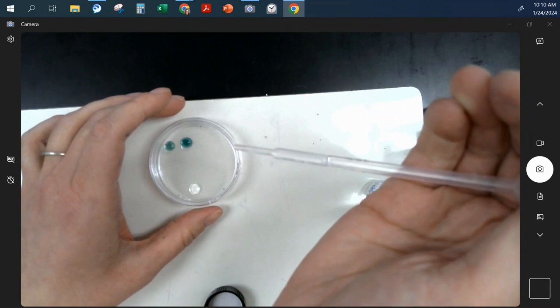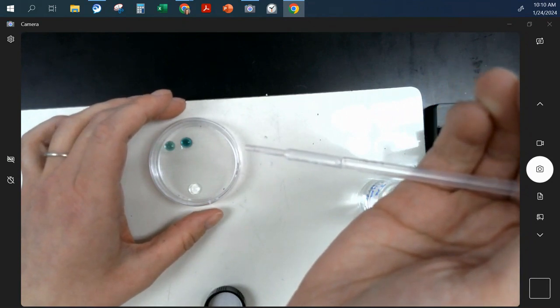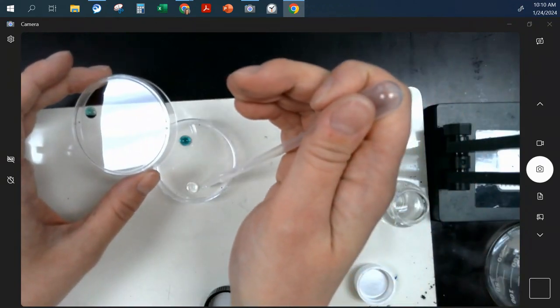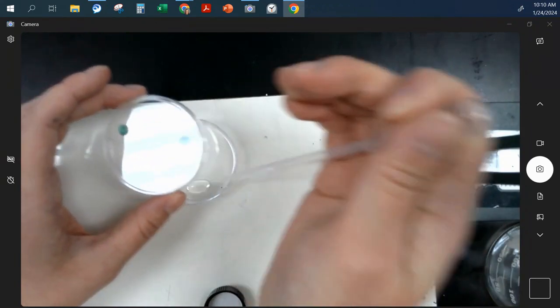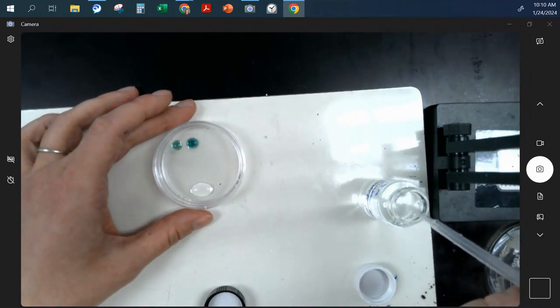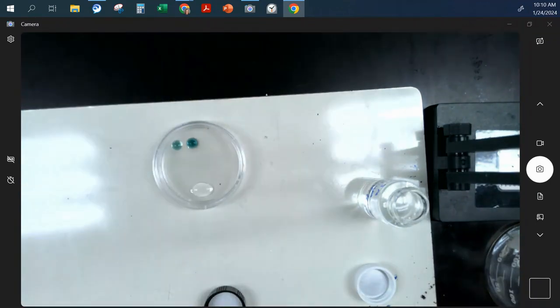Okay, we're going to put them next to each other. Pretty sure that they go next to each other. Okay, I just put 3 in there. Then we're going to see, hopefully our dye isn't old. I have more dye if this one's old. Then we're going to watch and see if anything happens. And I would start my timer.